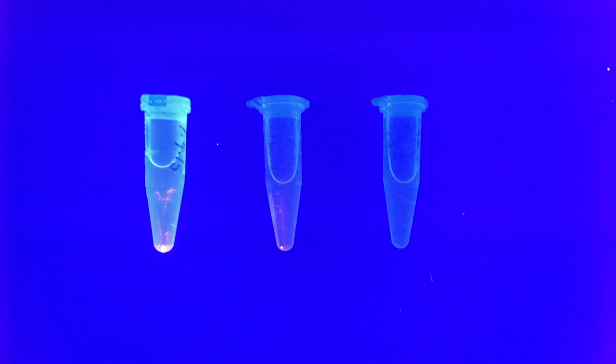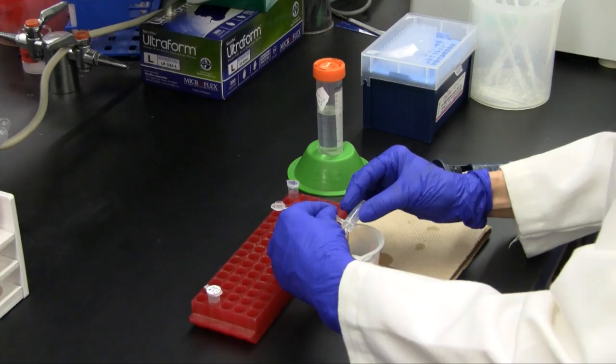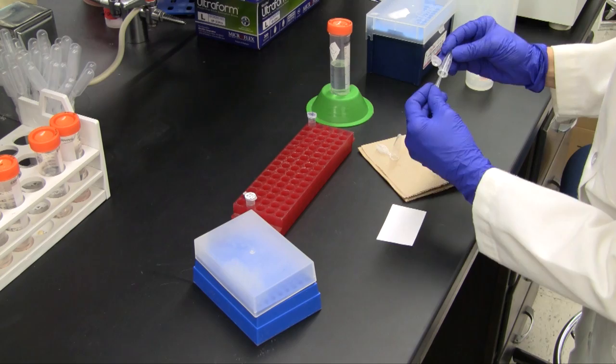The pellets are rinsed twice with 70% ethanol, with care taken to not lose the pellet. After the final rinse, the tubes are inverted to drain, and the rims blotted. Residual ethanol is teased out of the tube with an unfiltered 200 microliter pipette tip. The pellets are not allowed to fully dry, as they will be difficult to resuspend.